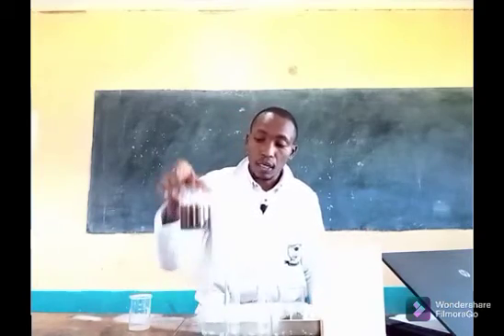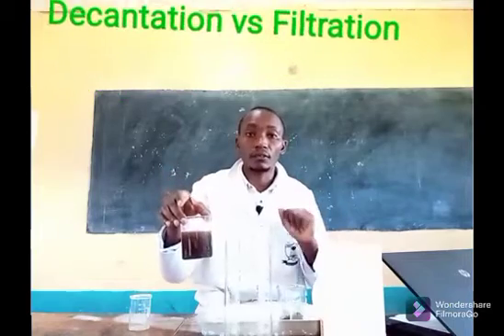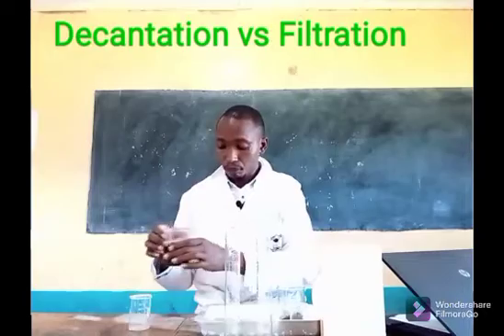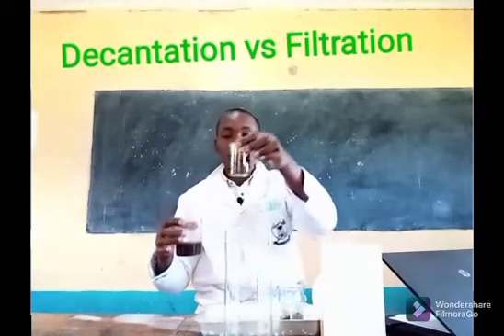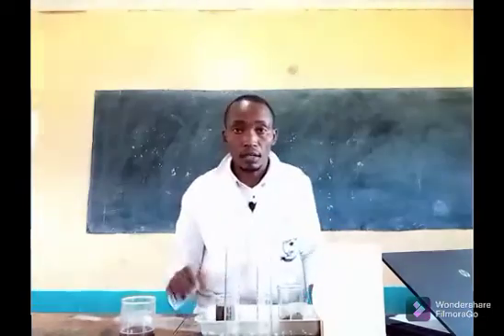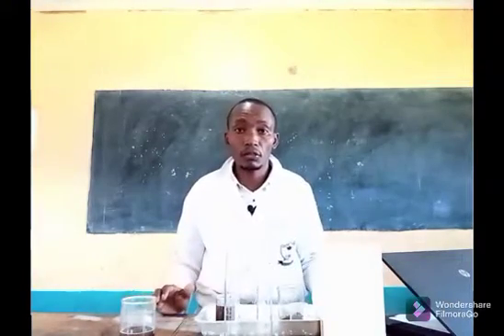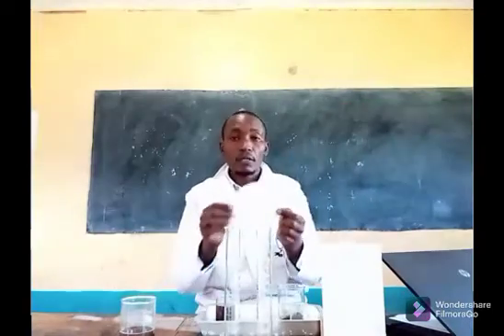What I need to do, I need to give the mixture a few minutes and it settles down. So what exactly I can do, I can have the mixture in one container here. I can start with filtration. I do filtration as I wait for the solids in the other mixture to settle. So where do I start again? I need a filter paper.